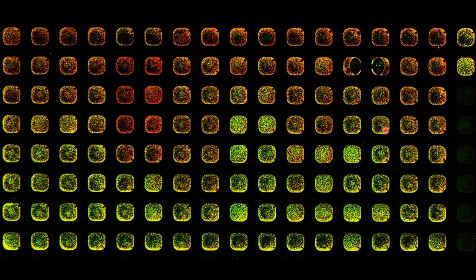You can imagine that when the laser is hitting a transparent well plate, it's like a fiber optic cable, and the light will be everywhere. So it makes sense to use these black plates to reduce this effect and to get very nice results like here.